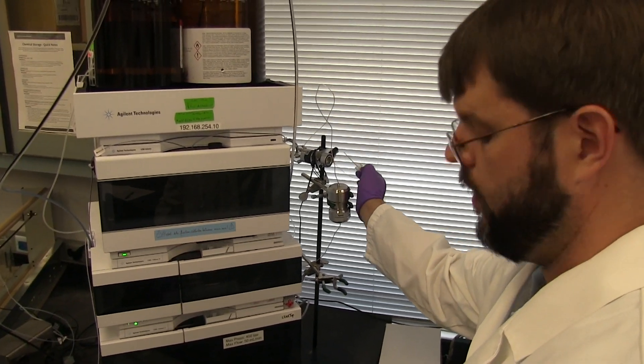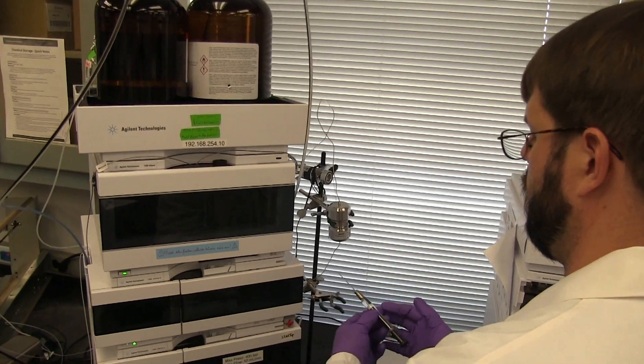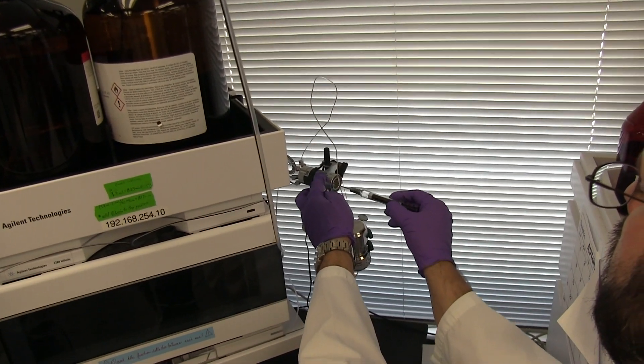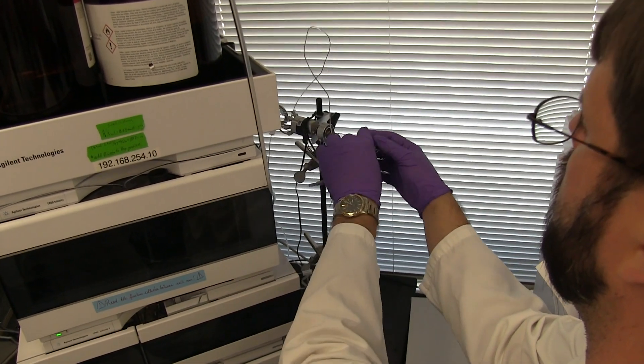The manual injector operates just like normal. The lever is in the load position and then we insert the syringe and fill the injection loop with our sample.